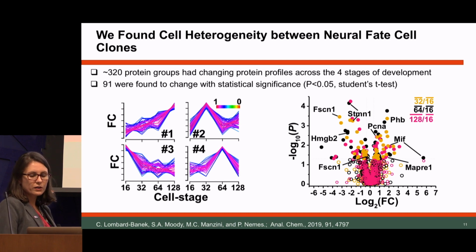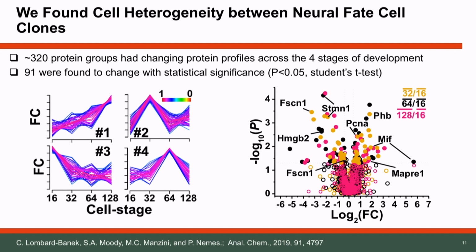Those results are very interesting because bulk analysis of those embryos showed that during the early stage, actually there are no changes. But when you look at those data at the single cell level, now you can really appreciate the small changes that happen during embryonic development, and that the commitment of the cell might actually start much earlier than previously thought.